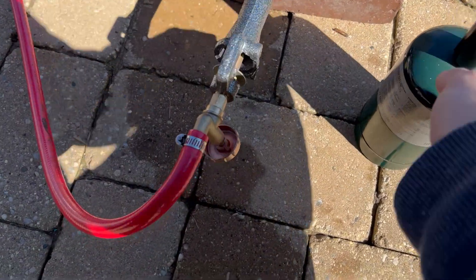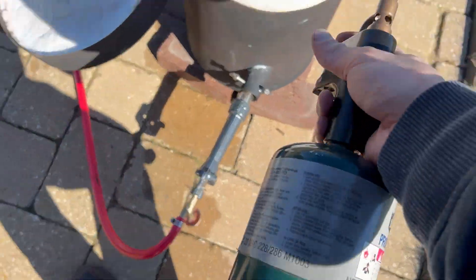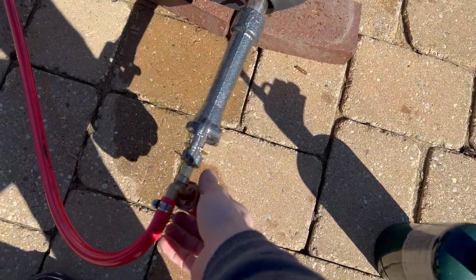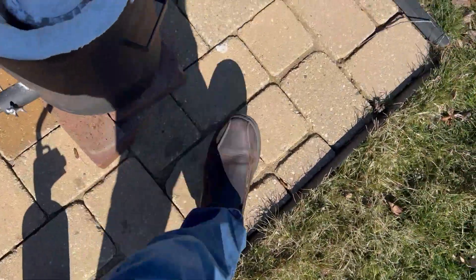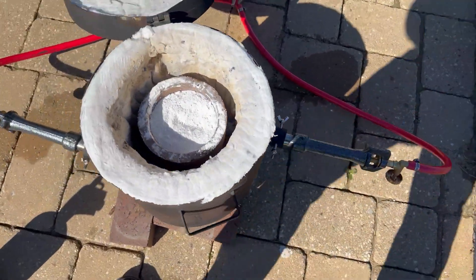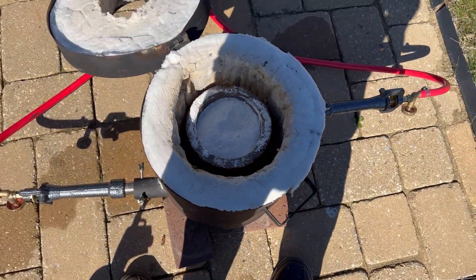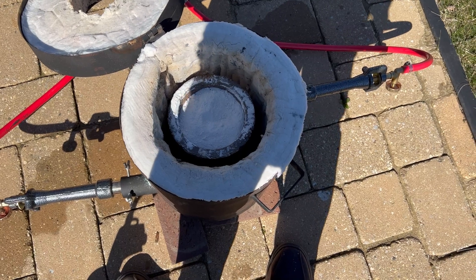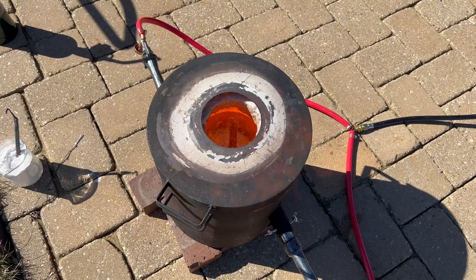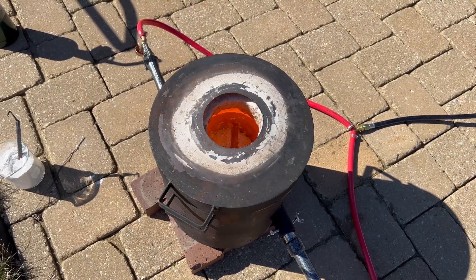The ore I have here is a mix of silver sulfide and lead sulfide. The first step is to reduce the sulfides to a metallic form — in this case, the free silver and the free lead. We can use a more reactive metal to replace the less reactive silver and lead through a reduction process. In this case, I will use iron, which will turn into iron sulfide, leaving the metal as lead and silver in their free elemental form.